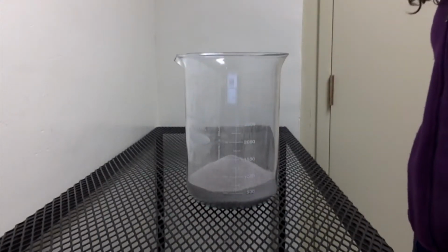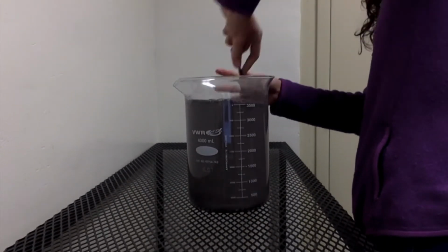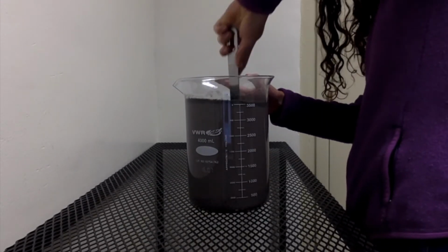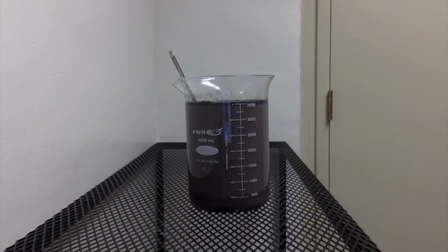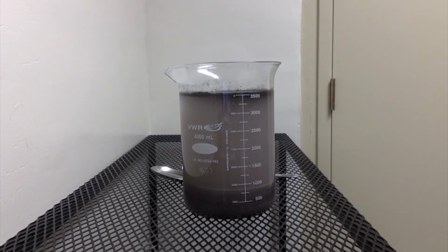First, I put the sample into the beaker. Then I add water to the beaker and stir. Then I let the beaker rest for 30 minutes, allowing the heaviest particles to sink to the bottom and the lightest particles to float to the top. So I can pour those off.